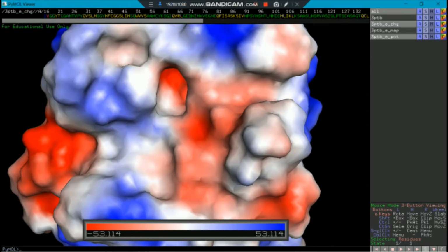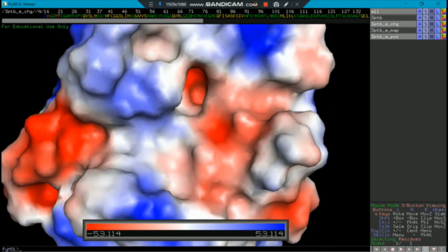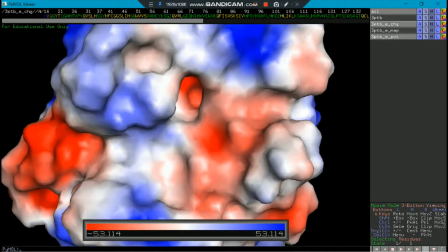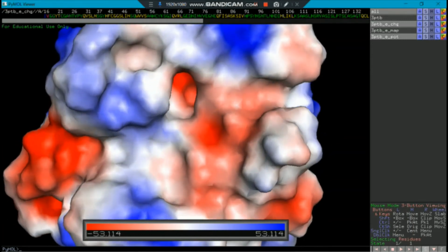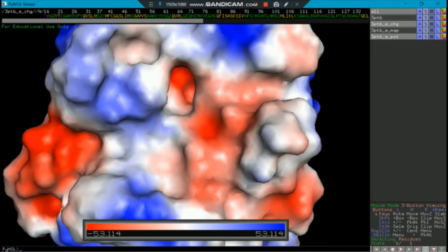In the center, you could see quite a deep binding site, right? I think this is a possible binding site where the ligand, the benzamidine chemical compound, could bind with our protein molecule and interact with it. So we have predicted two possible binding sites.